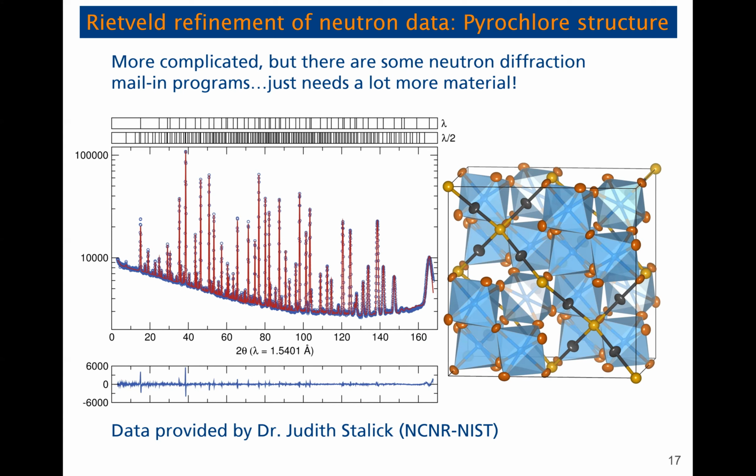Whereas for neutron diffraction, you need a lot more material. So in contrast, few milligrams for synchrotron, whereas if you're doing a neutron experiment, you need to send grams of material, which maybe in some fields is fine. Maybe you make a whole bunch of material at once. Me, I mostly make up to 200 milligrams of material at once, so I could do a larger batch. But for battery experiments, sometimes we cycle a material in a battery, like stuff lithium in there, and then want to see how the structure has changed.